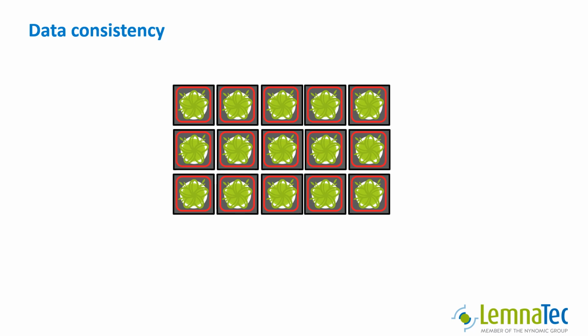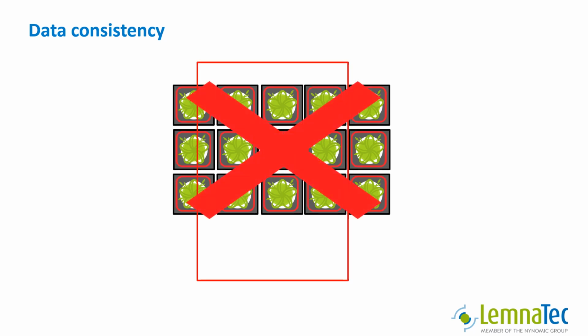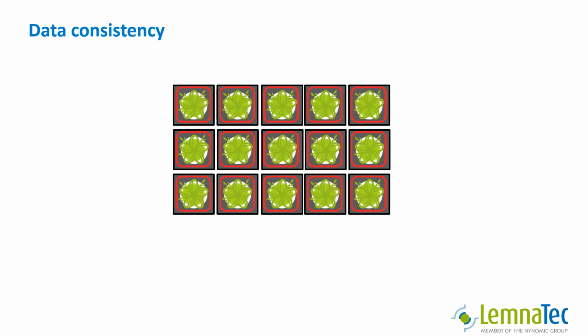However, if you accidentally run an analysis for a single plant on an image of a tray with 3x5 plants, you have a problem. For the same reason, you cannot now run the correct analysis. That said, this is not a problem that can't be solved. But this is not the topic of this video. We will talk about this in class 5.